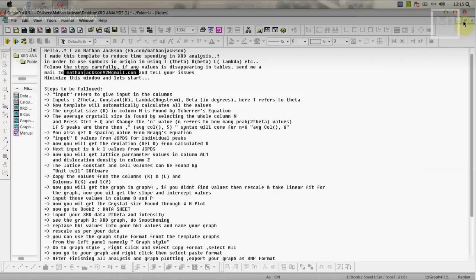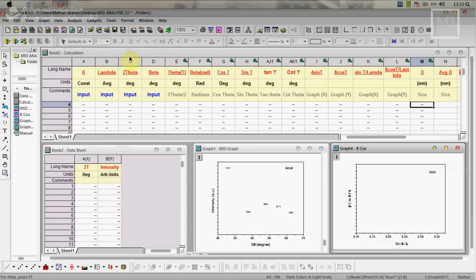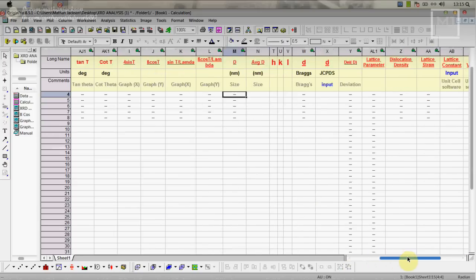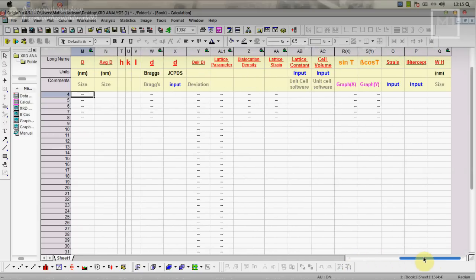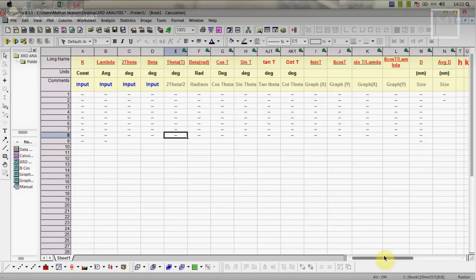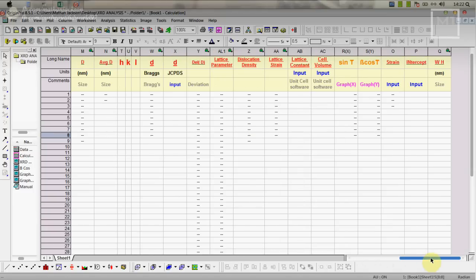I am using Origin 8.5.1. This will work only in Origin 8.5 or above versions. In this calculation part I designed it in such a manner it will cover almost all calculations. Here are the inputs we have to give: K, lambda, 2 theta and beta, which means FWHM full width of maximum. Here we have to give JCPDS value that I will discuss later.